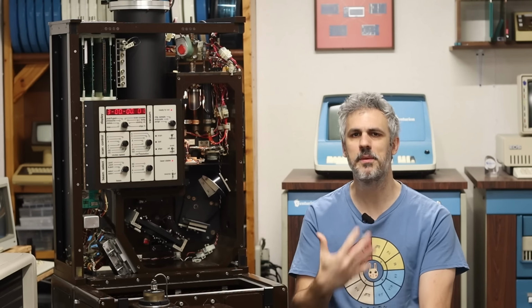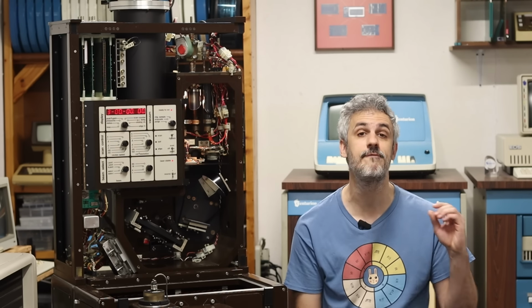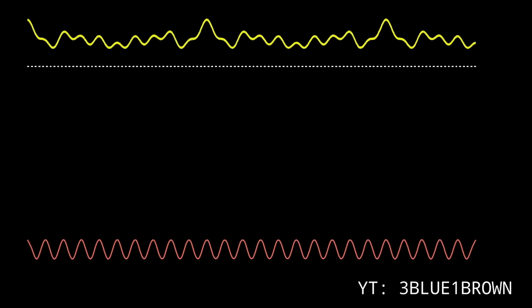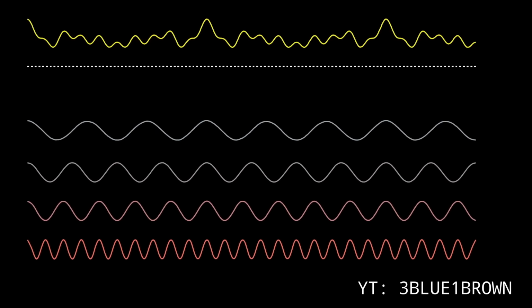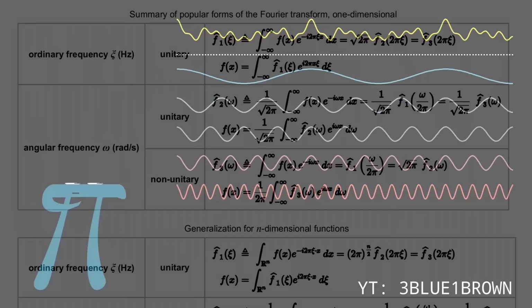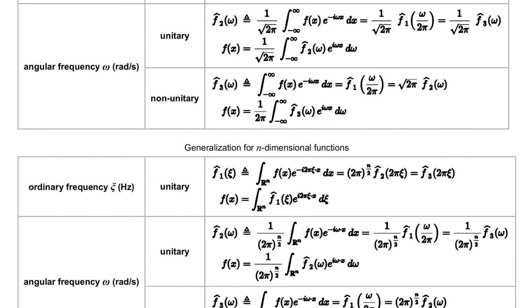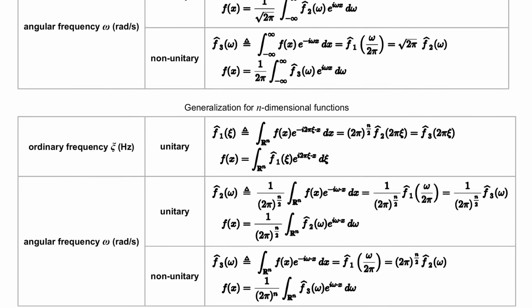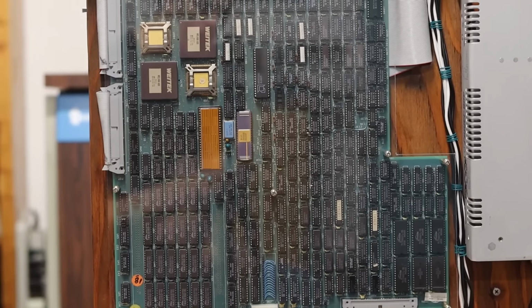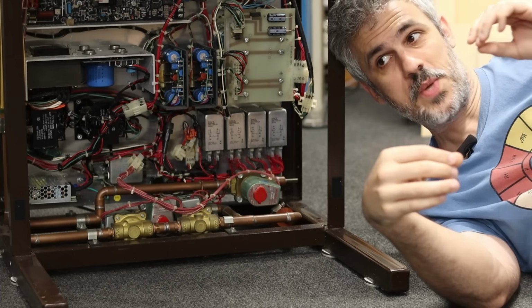But we have to be able to make some sense of that information, so we have to do some really complex math called a Fourier transform that takes a finalized waveform and breaks it out into all of the different wavelengths that create that finalized shape that we're seeing. I do not know how to do a Fourier transform. It is an incredibly complex piece of math, but that's why we have the high performance vector processor bolted to our PDP 1173.